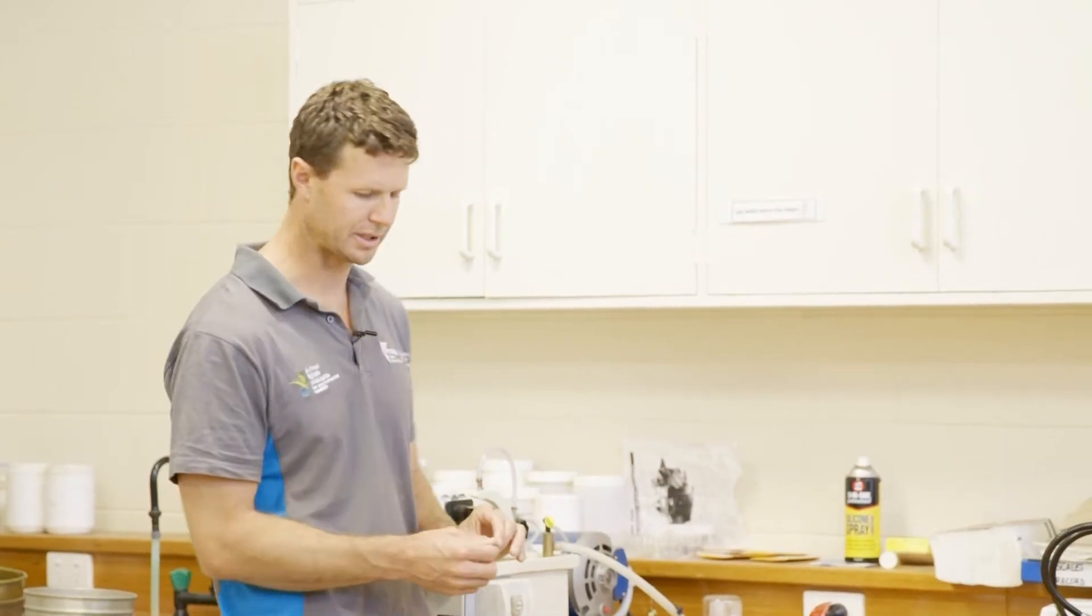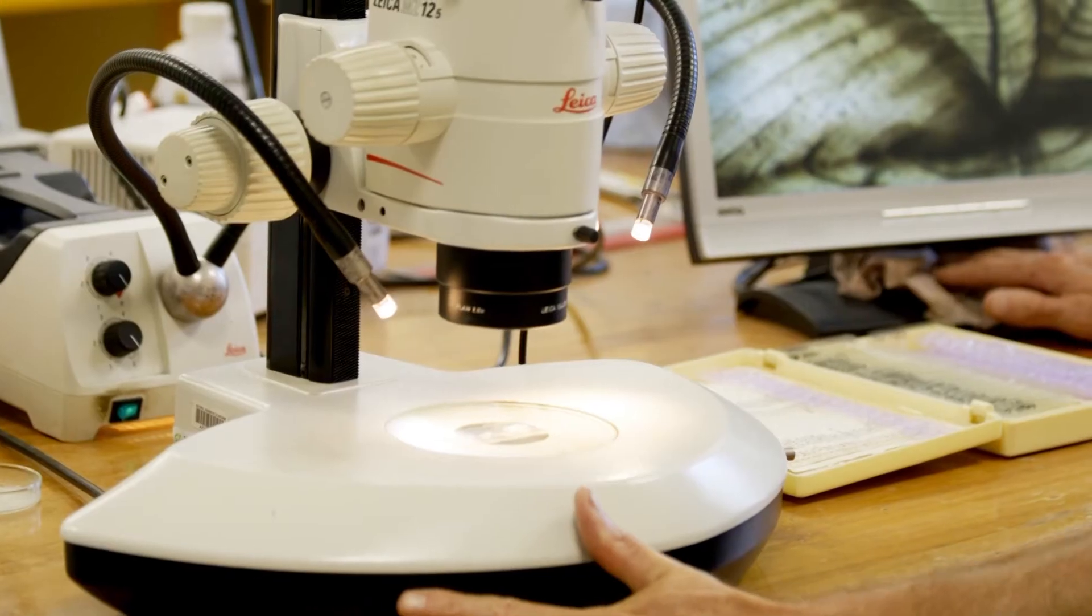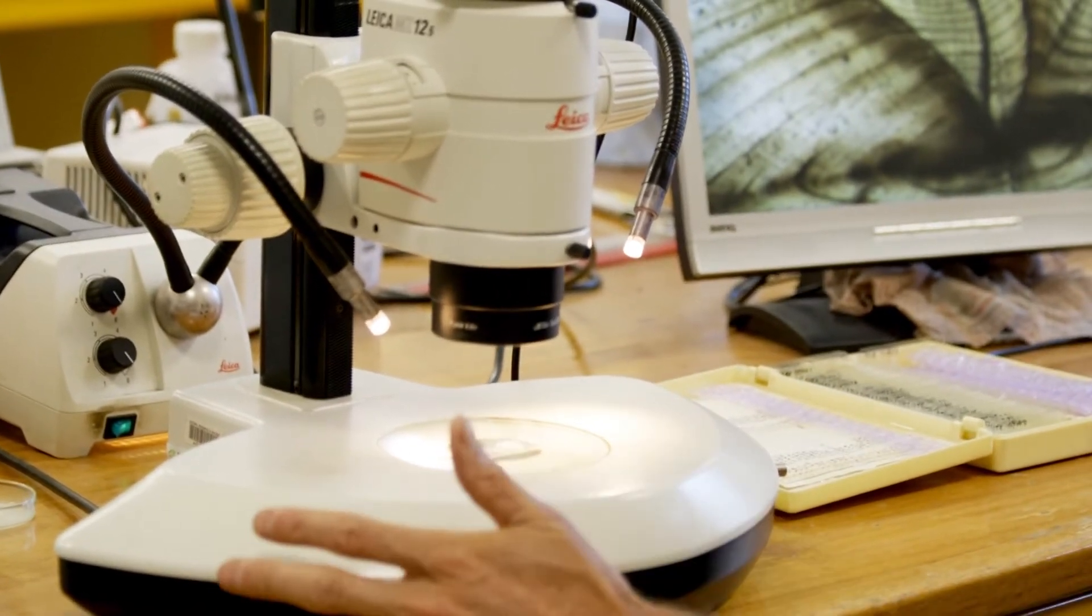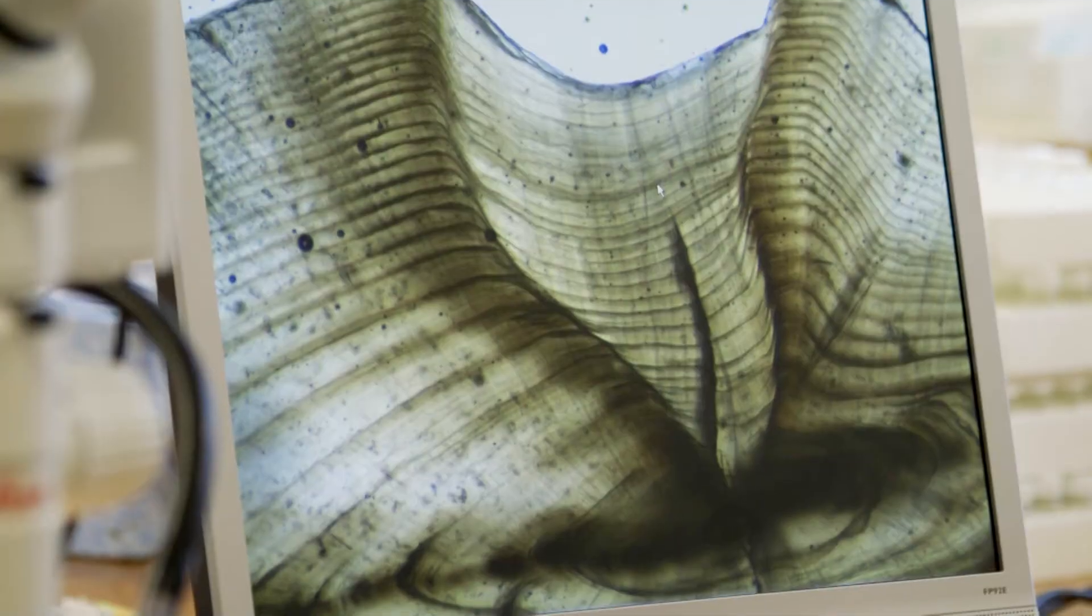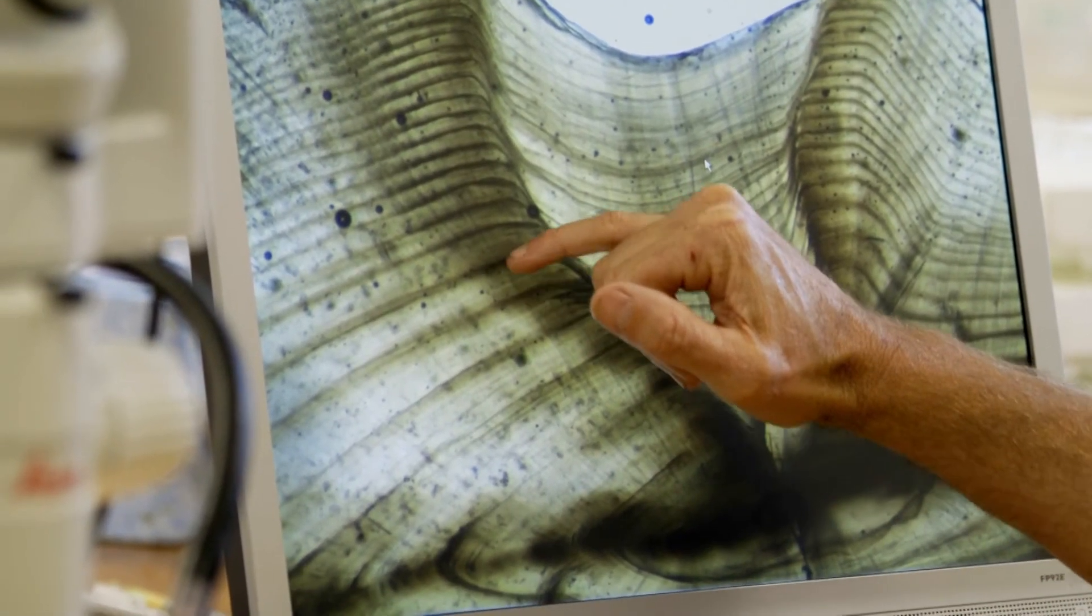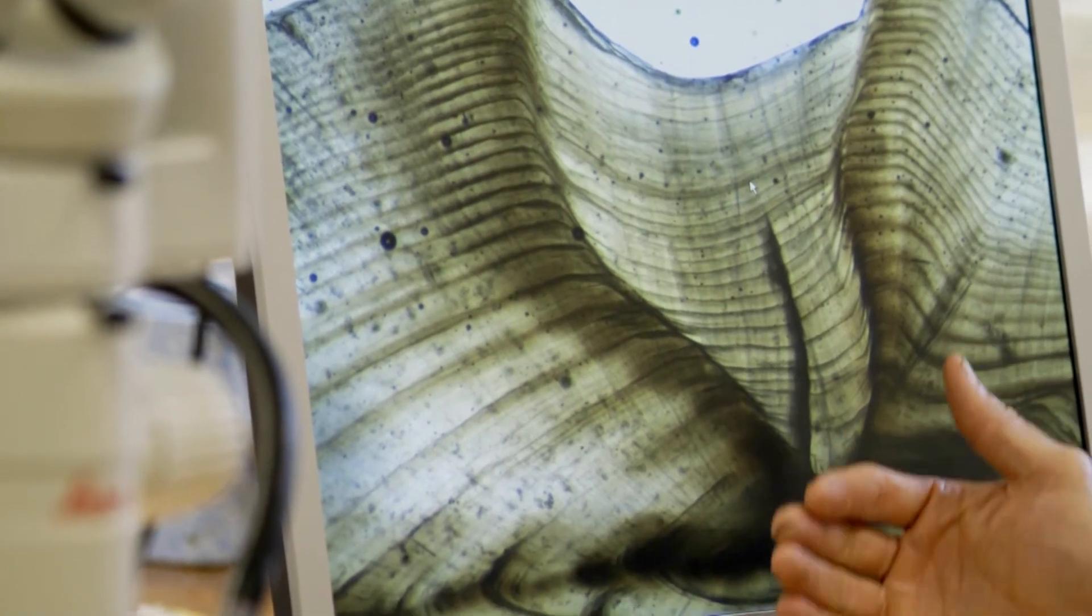Once the sections have been cut we glue them onto a microscope slide and then look at them under a microscope. For a little bone in a fish we can get an amazing amount of information. If I zoom in we can see each of the rings, and this is basically how we age our fish. Count the number of rings and that's how old the fish is.